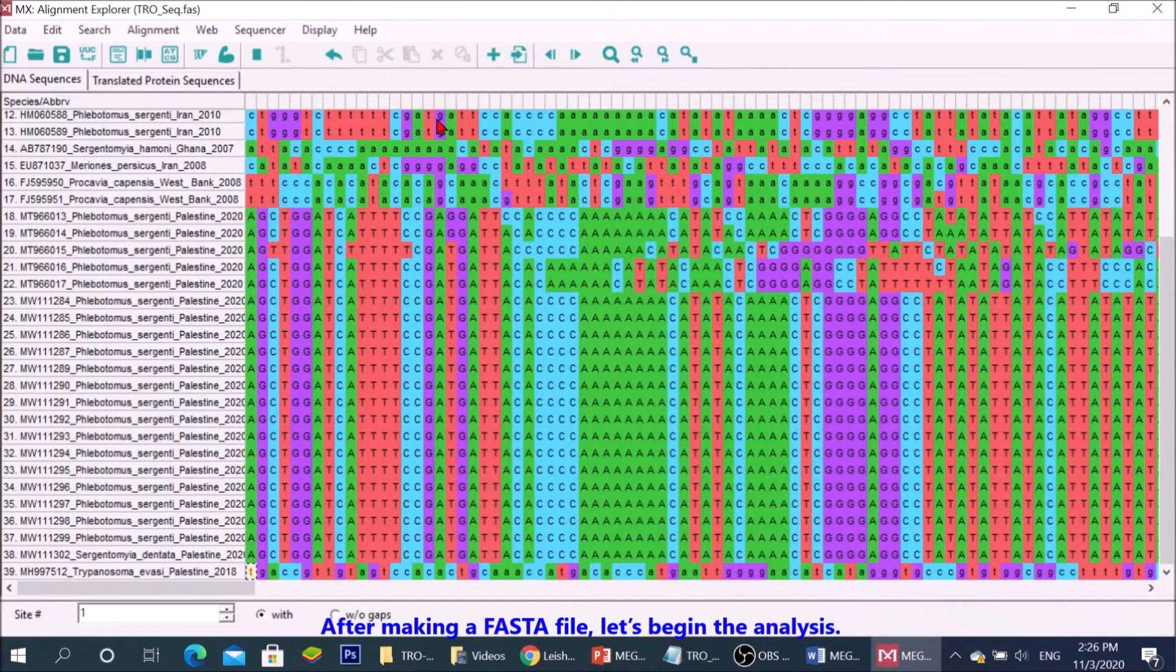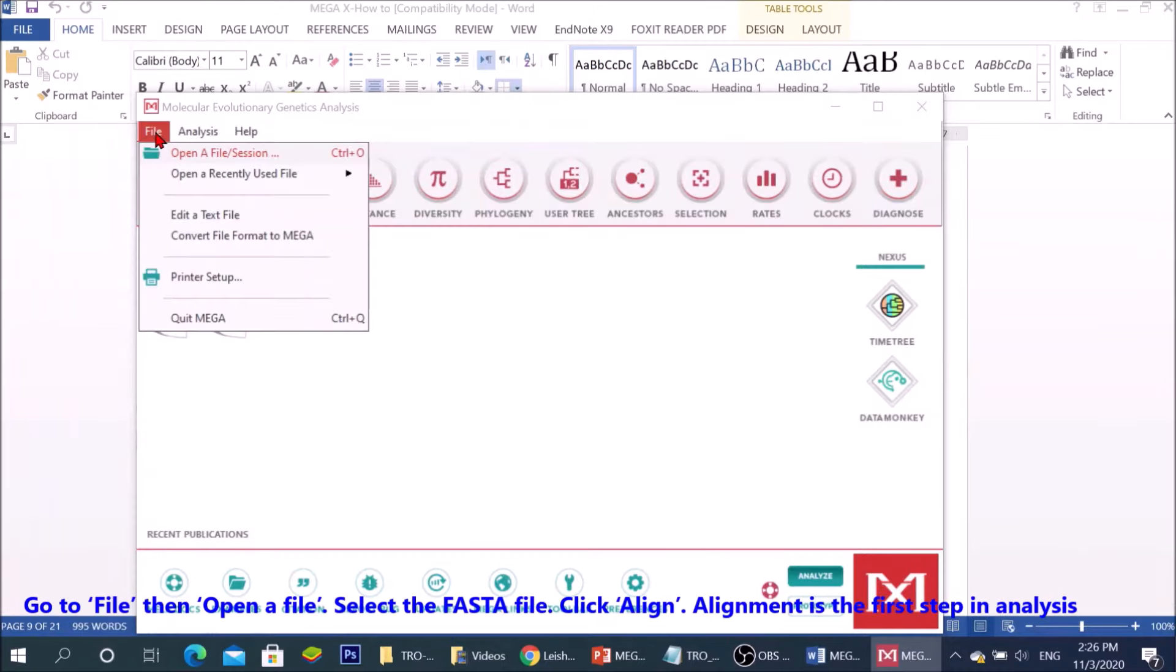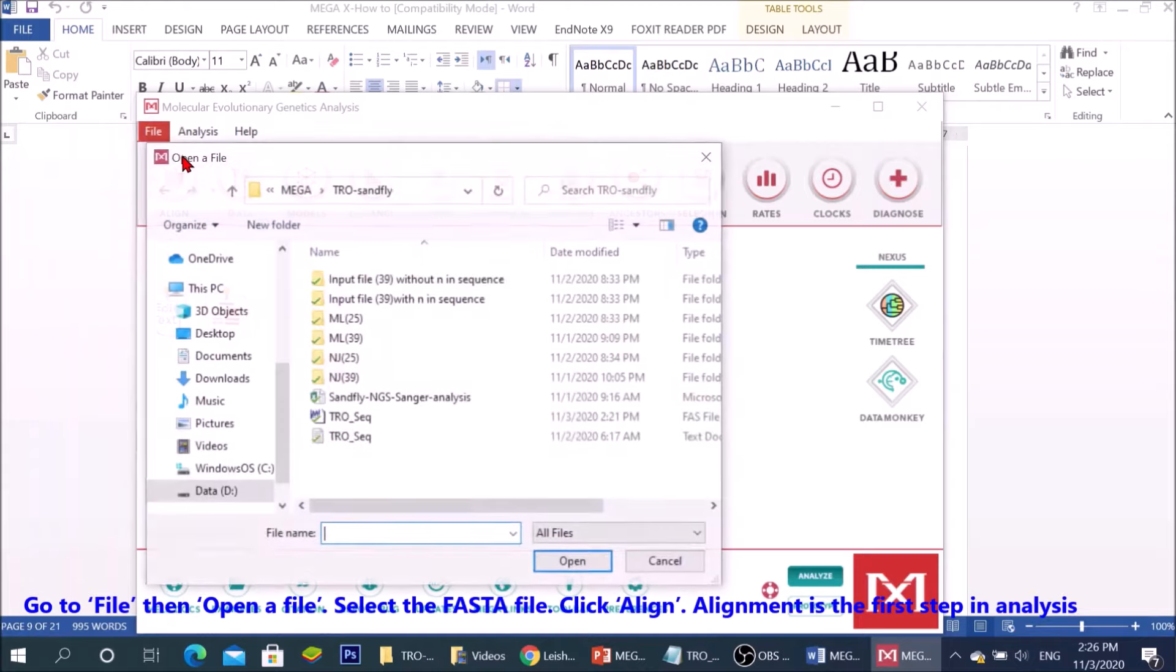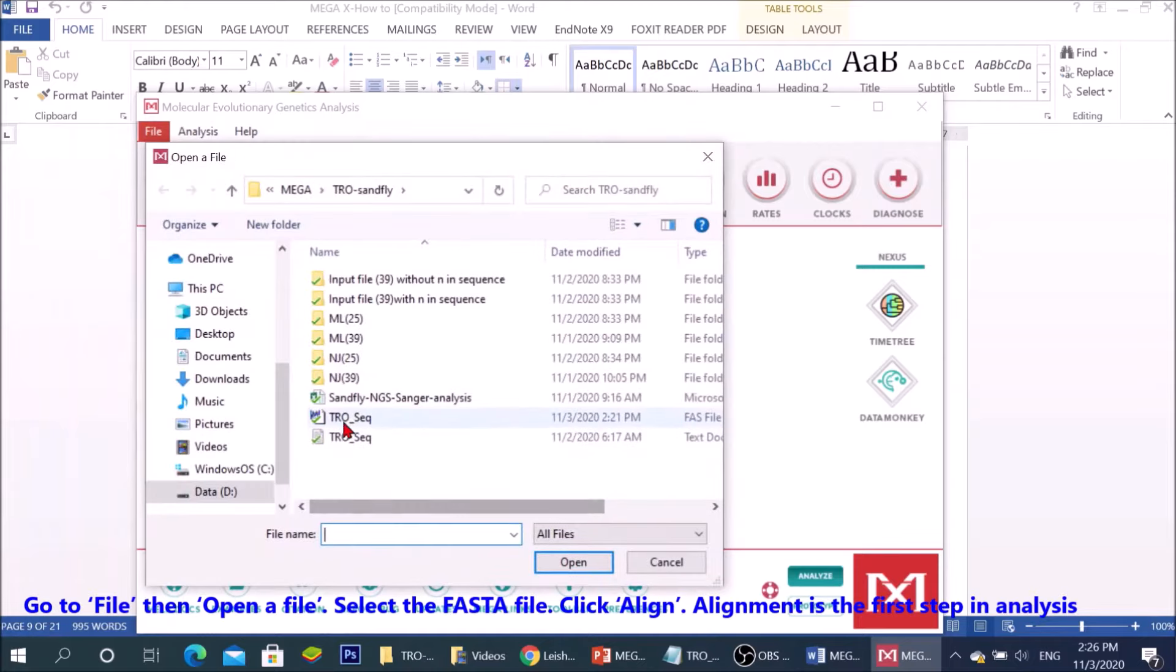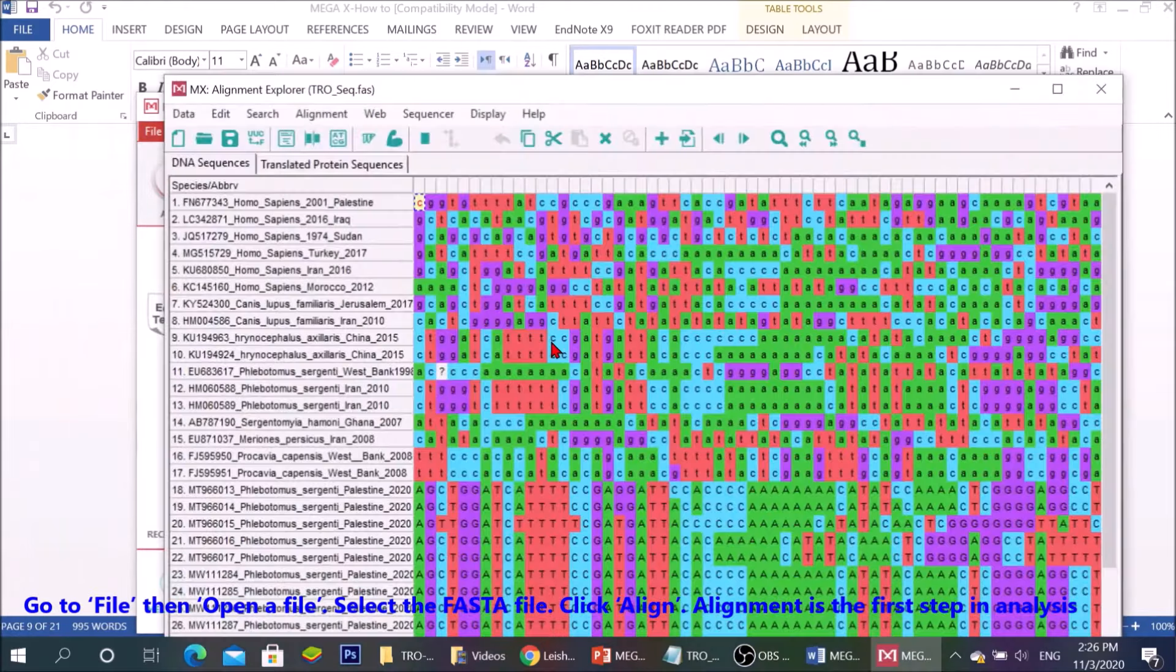After making a FASTA file, let's begin the analysis. Go to file, then open a file. Select the FASTA file. Click align.